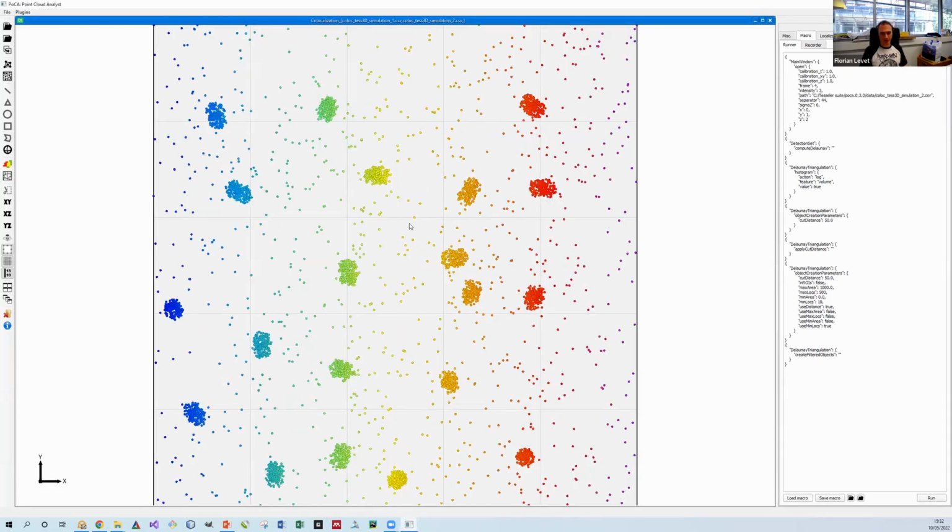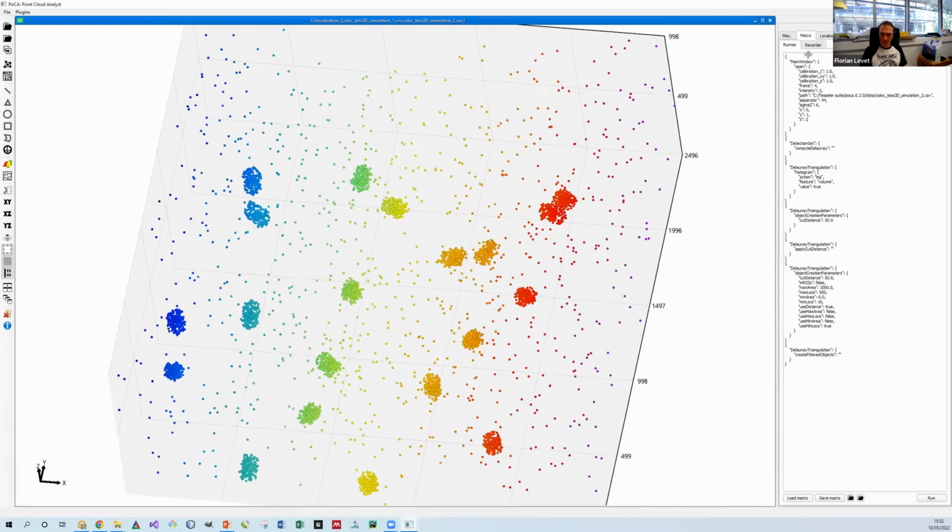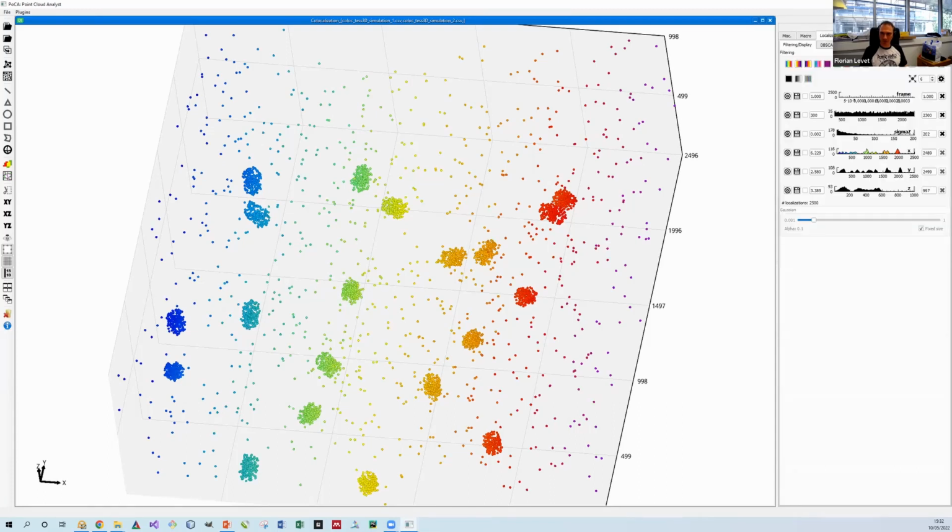So now you have the 2 data here. You cannot really see where the first staining is and the other, but you can very easily switch between the different colors with these 2 buttons. And if you go to the localization, you can say, okay, I am applying, please.